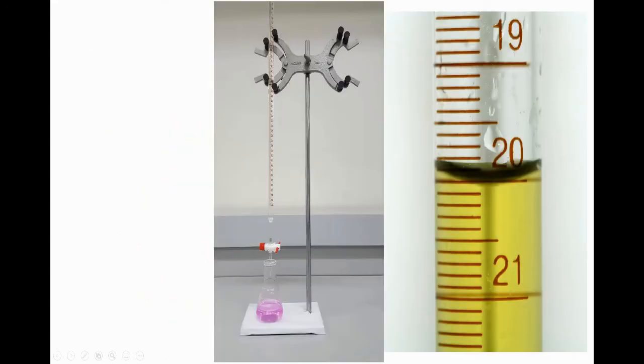So I think, oh yep, one more slide I wanted to show you. So what we've kind of selected as the activity for today is kind of a virtual titration lab. This one is put on by a program called Labster, and it's supposed to be more interactive. Sometimes the graphics and little things are a little weird. You'll see what I'm talking about. But hopefully it'll be something just a little different that can help you get a little bit more of a lab feel. But one thing I wanted to point out about this setup is that the markings on the burette can sometimes be a little tricky.